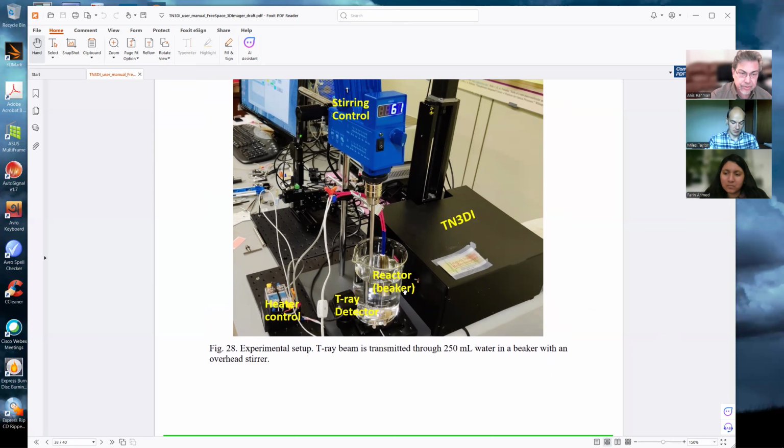More sophisticated experiments probably would be able to. But here, all we did is assume it's only a 1% hydrochloric acid solution. So you take 99 milliliters of water, 1 milliliter of hydrochloric acid solution, and put it at a temperature closer to what is inside the stomach. Then assume that this is a simulated stomach fluid. That's what is done here. And then it is agitated or rotated by this mixer.